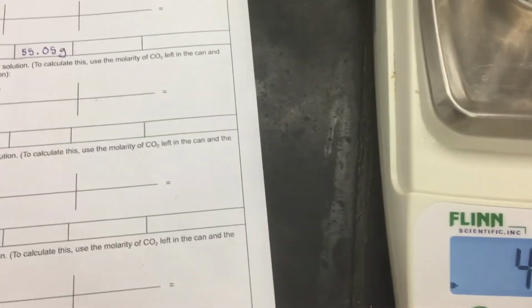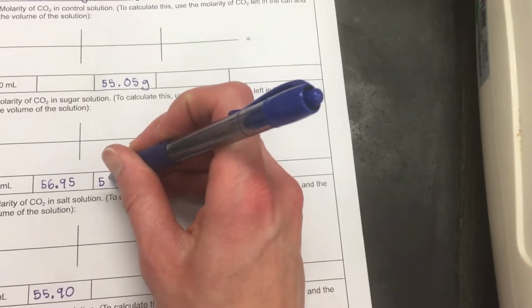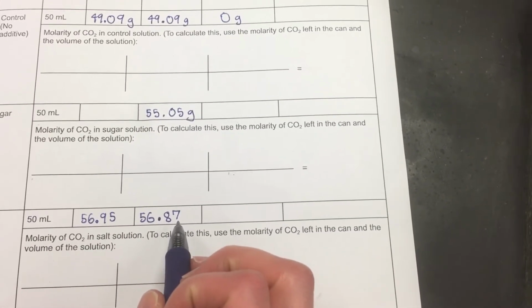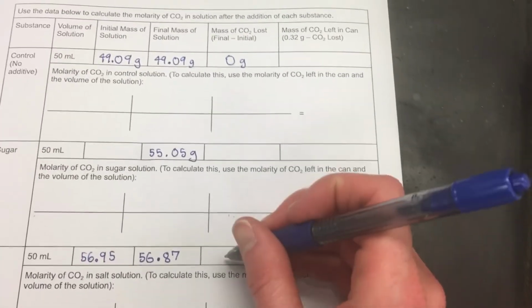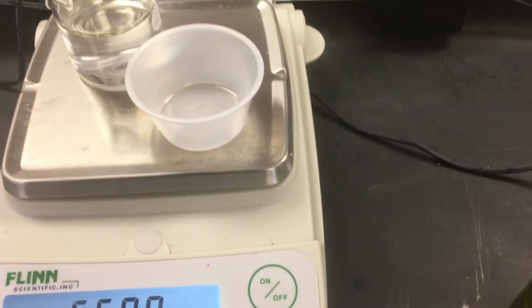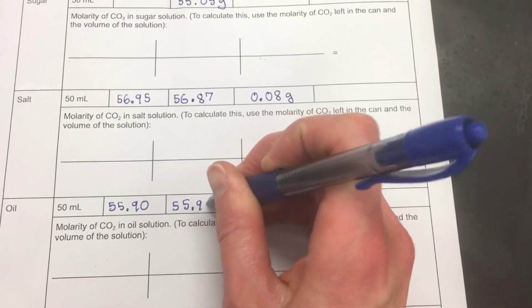Oh, actually, it's gone down to about 87, so 56.87. So obviously, you can see that we have lost some CO2 here. It looks like we lost about 0.08 grams. And then if we look over here at the oil, it's still at 55.90. So we didn't lose any CO2 in that beaker.